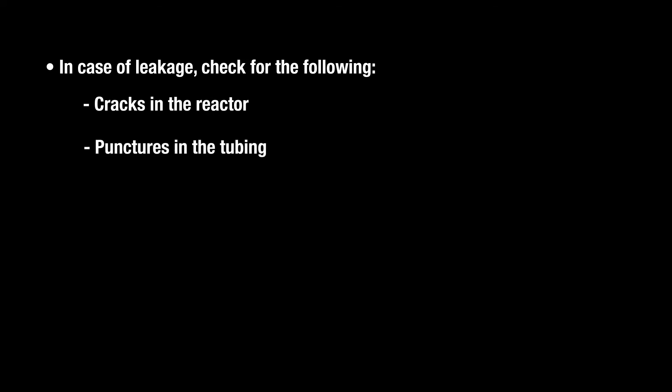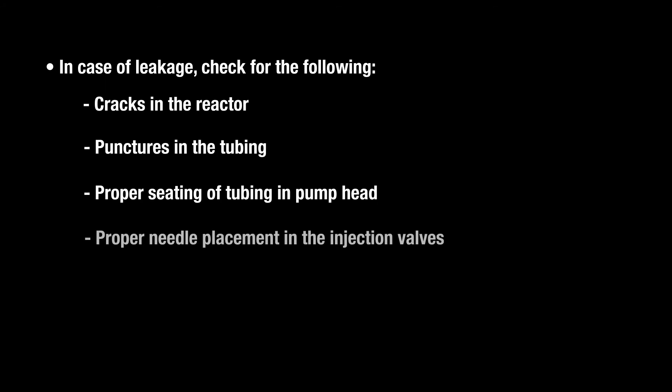In case of leakage, check for the following: cracks in the reactor, punctures in the tubing, proper seating of tubing in the pump head, proper needle placement in the injection valves, and clamps removed from effluent tubing.